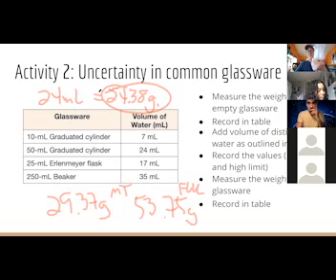So maybe you want to measure these with a ruler and then see which one is halfway between 50 and the base. That'll give you a rough idea of where 25 is, but still, that's going to be a hardcore estimate. Basically flying blind on this one. So are we able to use this one to do 35?